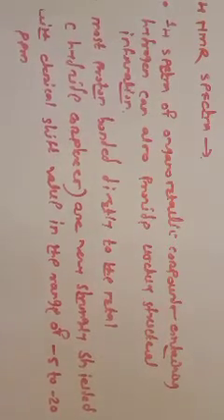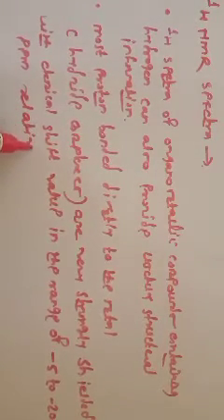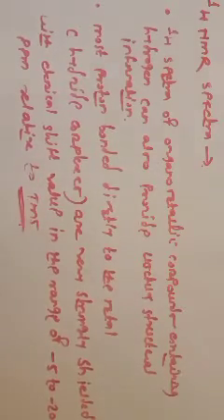So this is the information we get from H1 NMR spectroscopy: whenever the proton is directly attached to the metal atom, its chemical shift value ranges from -5 to -20 ppm relative to TMS, that is tetramethylsilane, which is used as the reference in H1 NMR spectroscopy. So this is the first point.